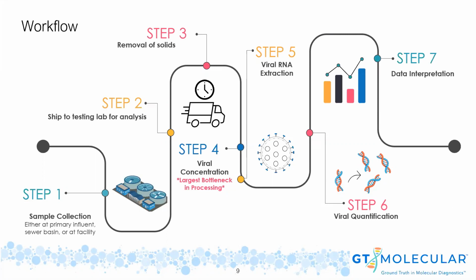As we were getting started, we looked at the common workflows used for this type of analysis through the lens of how to meet the state of Colorado's needs. In doing so, we identified 2 steps in this process that could be optimized for throughput and sensitivity. The first step, right for optimization, was the viral concentration step.